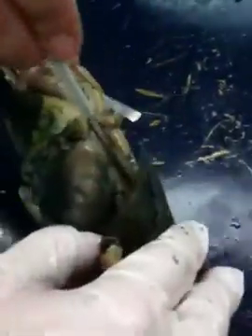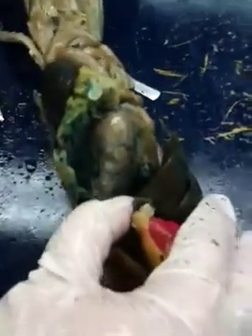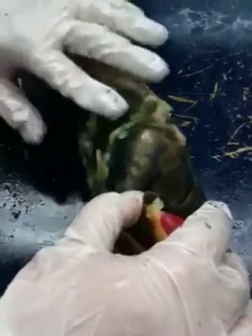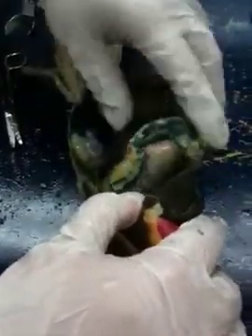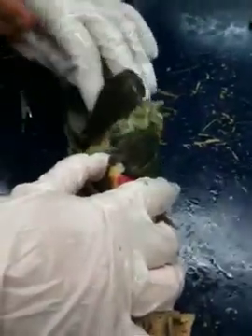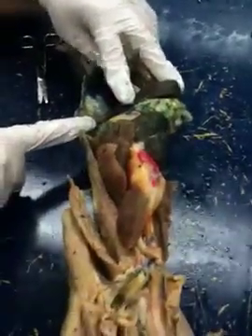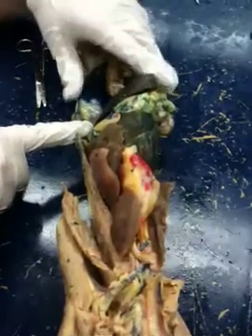Stomach, we're going to have to cut open on Thursday too, so you can see the rugae. Cardiac sphincter is at the top. Pyloric sphincter is at the bottom. And we already went over pancreas, spleen, and all that. Hepatic flexure, we went over that. The only other thing we're going to need to do on Thursday is the kidneys here. You're going to have to clean out the fat around them so you can see the arteries, veins, and the renal pelvis, along with the rest of this little list.